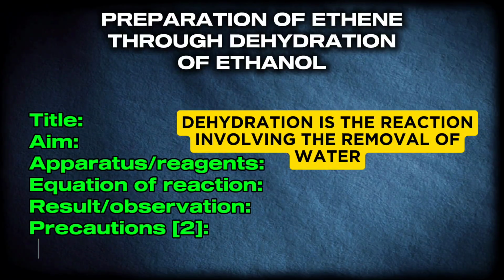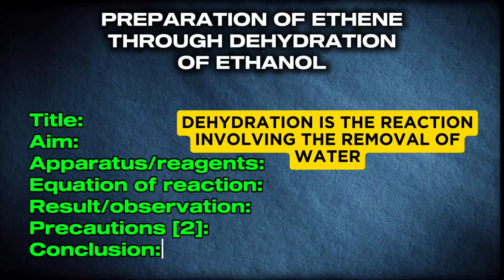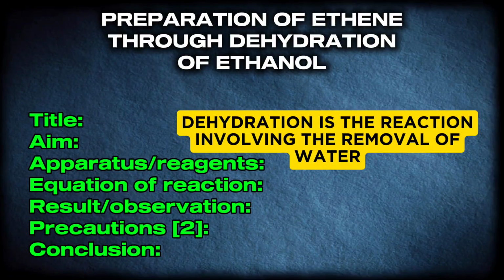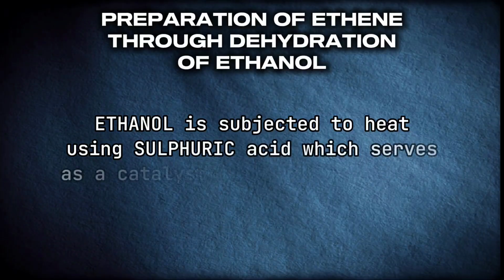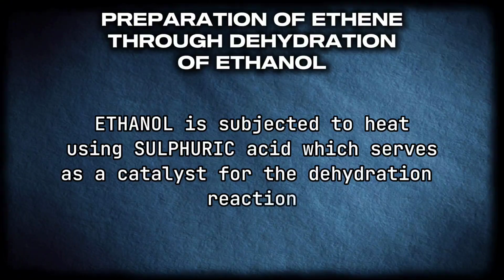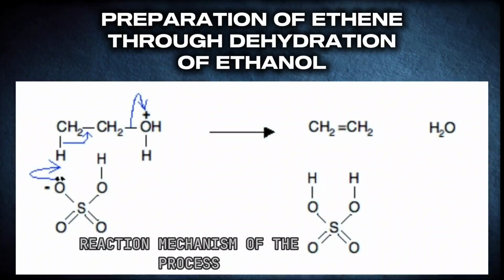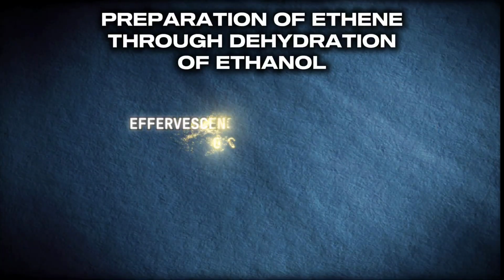All right. So the process is called dehydration, removal of water. Now, in this process, ethanol is heated with excess of sulfuric acid at a temperature of about 170 degrees Celsius. You don't really have to check up the temperature. All right, there is an observation that could be looked into, that is the formation of darker color in the reaction mixture. All right, that's a sign to tell you effervescence is occurring in the liquid.